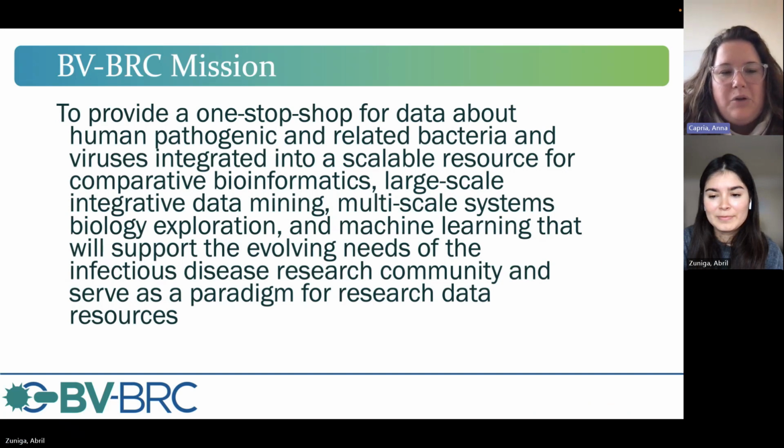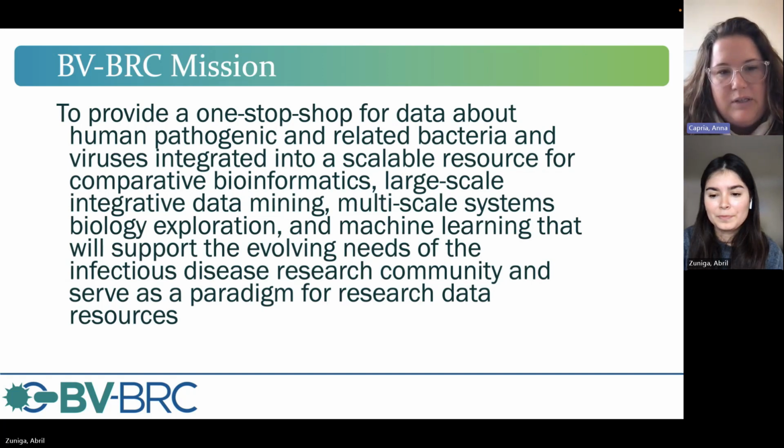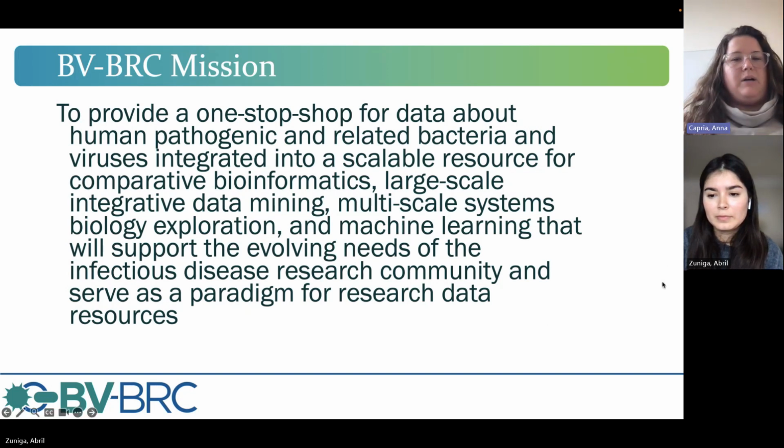Hopefully you are familiar with the BV-BRC, but if you aren't, we are an NIH-funded resource to support the bacterial and viral communities for having the data about the pathogens, and then also bioinformatic tools to make accessing that data and analyzing your own data as useful as possible.